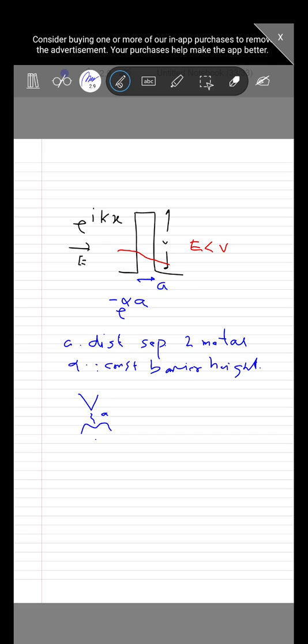So whenever we scan the tip across the sample, it measures the changes in current. The probe is attached to a piezoelectric ceramic, PZE, which provides the necessary change to follow the topography of the surface, and we get the surface structure. This is actually used in the case of STM.